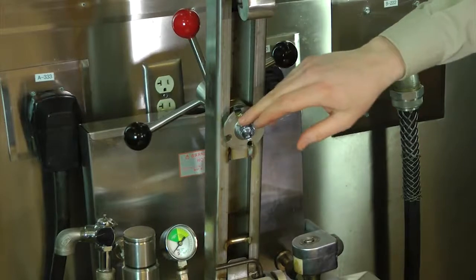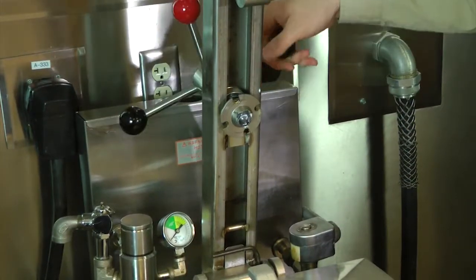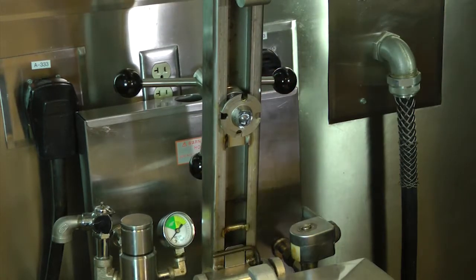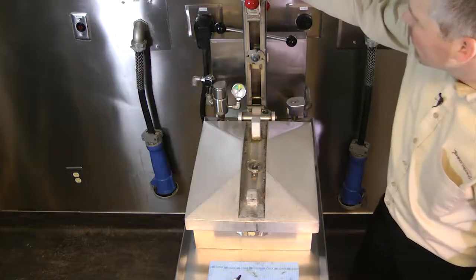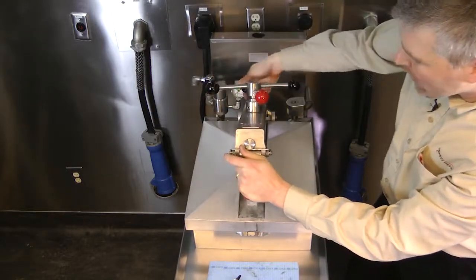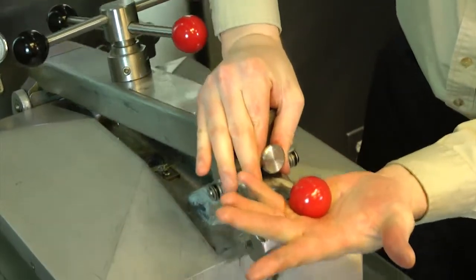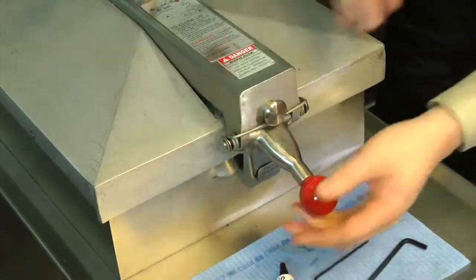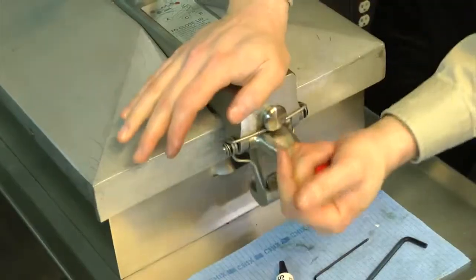When we lubricate the thrust ball, ball seat, and the spindle, it's a job that needs to be done every 30 days, and there is a separate document on that, but when you do the limit stop adjustment, it's a perfect time to do that. To put your crossarm back onto your lid, make sure the spindle is all the way up, pull the release pin, hold that out, lift up on the latch, and then let it snap back together. We can test it out, make sure it's caught on there, lift it up and down.